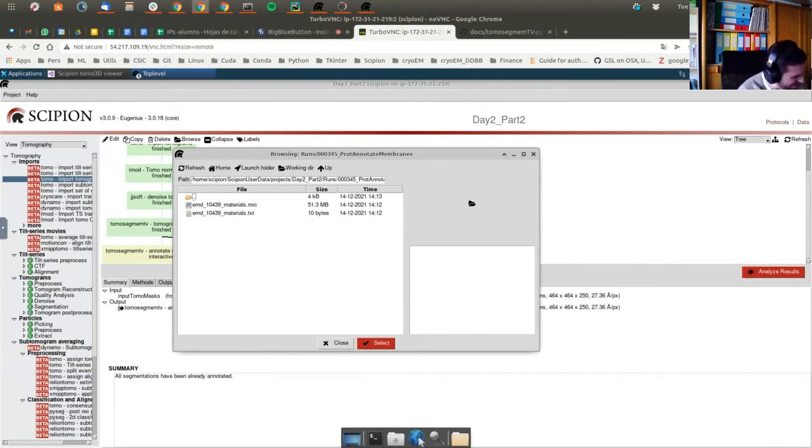No worries, no worries. For the next code revision, I will add some functionality to ask you before closing if you are sure. Maybe it's necessary. Not for you, because it happens to me a lot of times. So I think it's necessary. I'll do it.